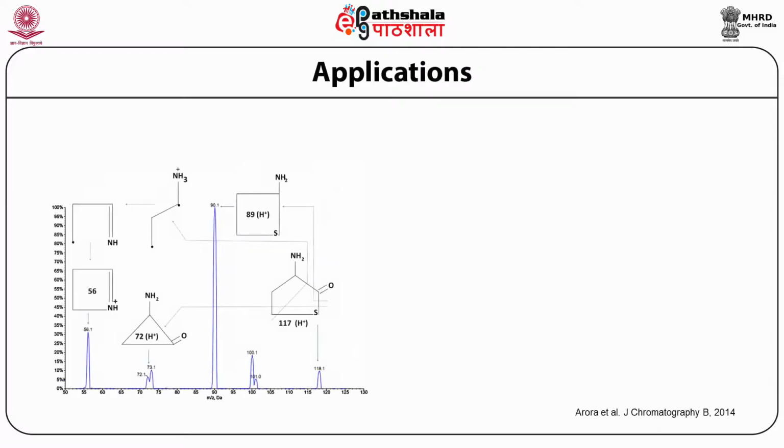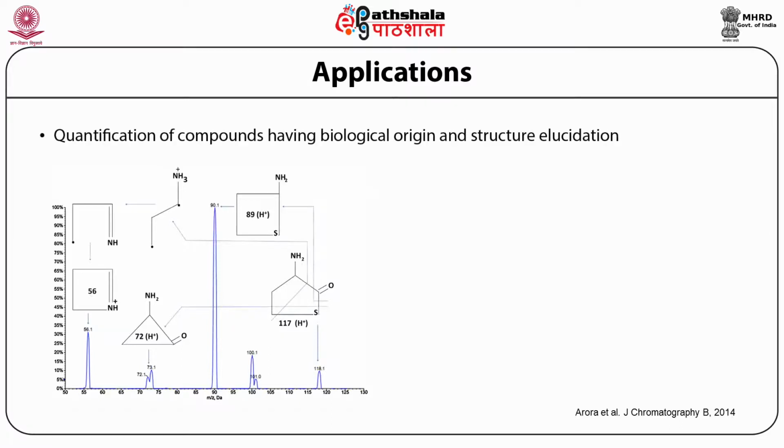Okay, as of now we have seen several parameters, we have seen gas phase transitions, we have seen different modes. Now let us see their applications, where they can be used. In this picture, what you see here is the quantification of compounds having biological origin and structural elucidation.